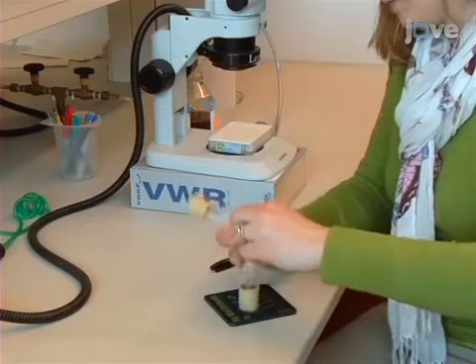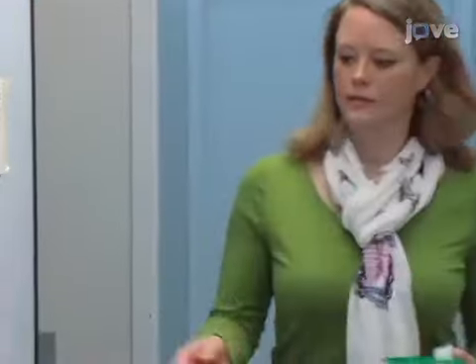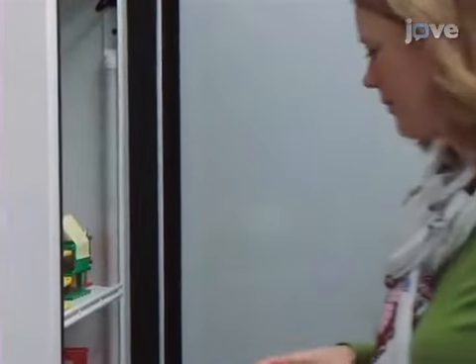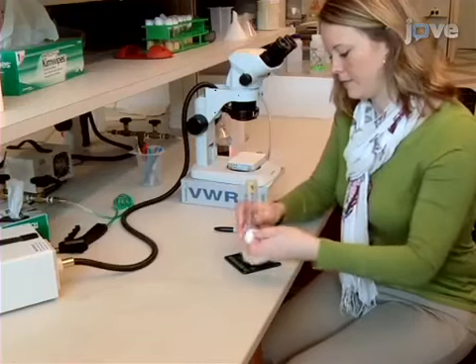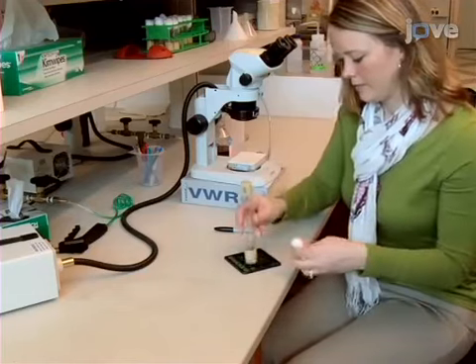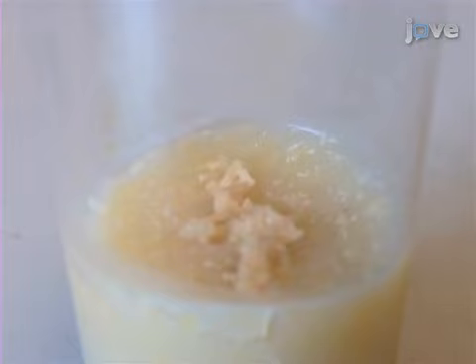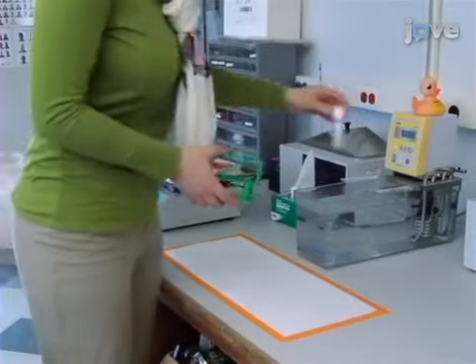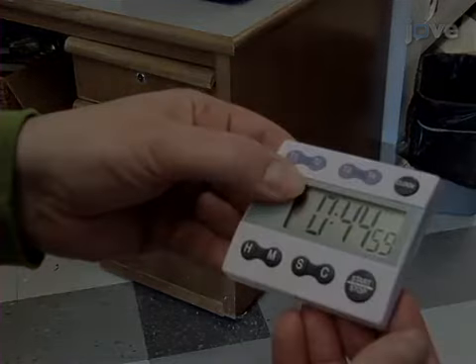Then, transfer the flies from the pre-lay vial to a fresh vial with fresh yeast paste, and allow them to lay for 6 hours at 25 degrees Celsius. After 6 hours, transfer the adults back to pre-lay vials for storage and use in subsequent experiments. Immediately heat shock the collected lay vials in a circulating water bath for 45 minutes at 38 degrees Celsius.